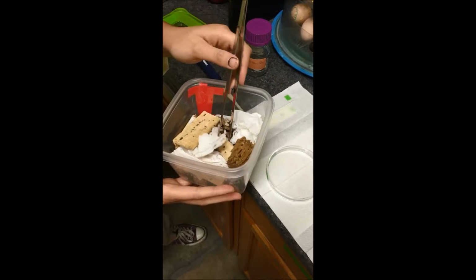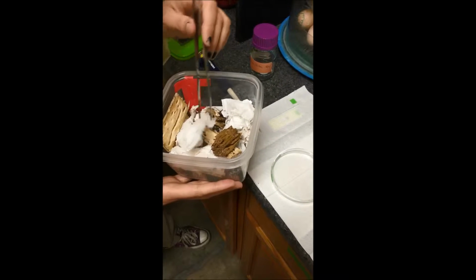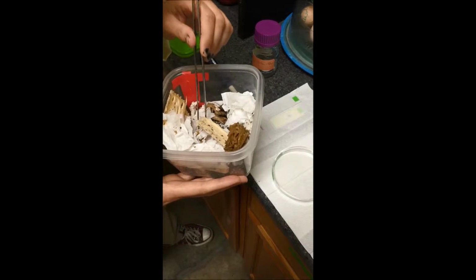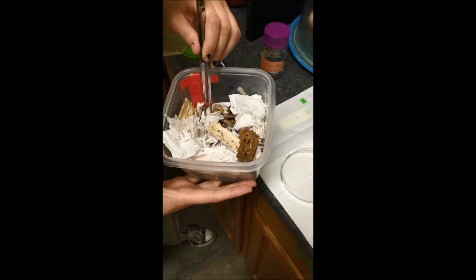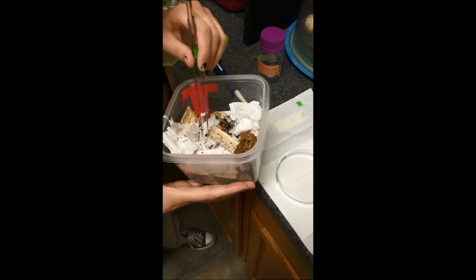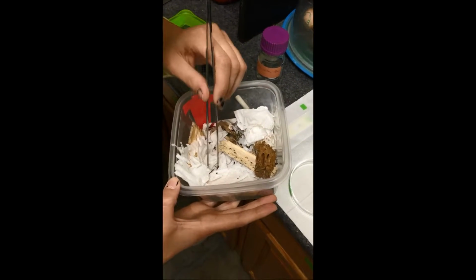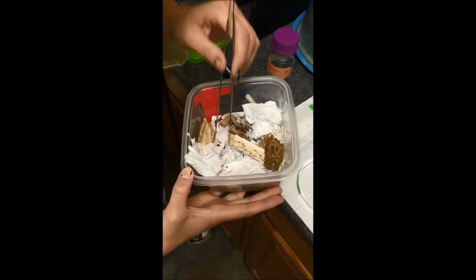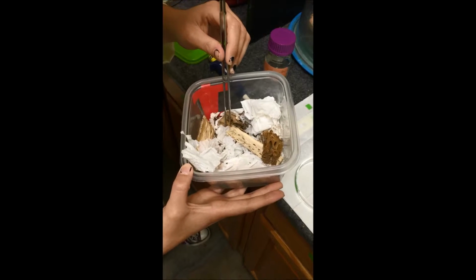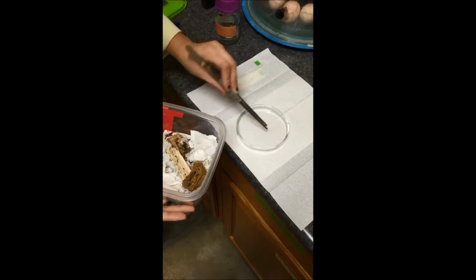We have 2 bins, one's for working termites and then the other one is for resting termites. So after we get them to basically just poop for us, we have them take a little breather in the resting termite bin. And it's important that we don't get something like these guys with the little horns, if I can find one, because those are the soldiers and he's hiding, so never mind. We get kind of the younger looking ones that are lighter in color and not too small, but kind of medium sized.